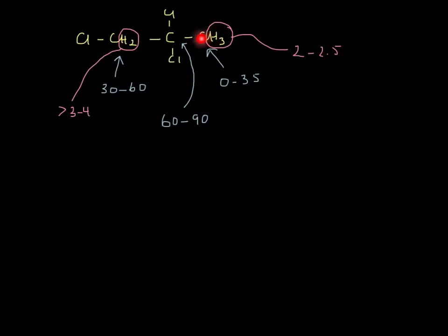The reason for that is it's hard to tell the difference between a doublet or two single carbon environments by carbon NMR. So normally what happens is you just run them with the hydrogens having no effect. You can of course turn that off if you want to, and what would happen is carbons that are all by themselves with no hydrogens would appear as singlets. Carbons that have one hydrogen would be doublets. This carbon over here, which has two hydrogens attached to it, would actually show up as a triplet.